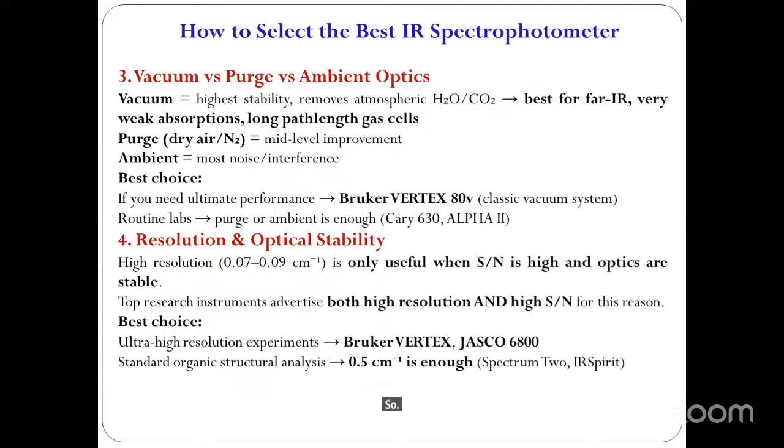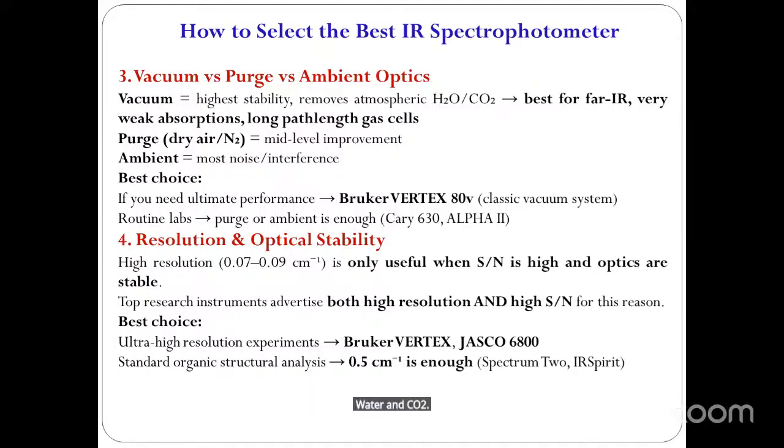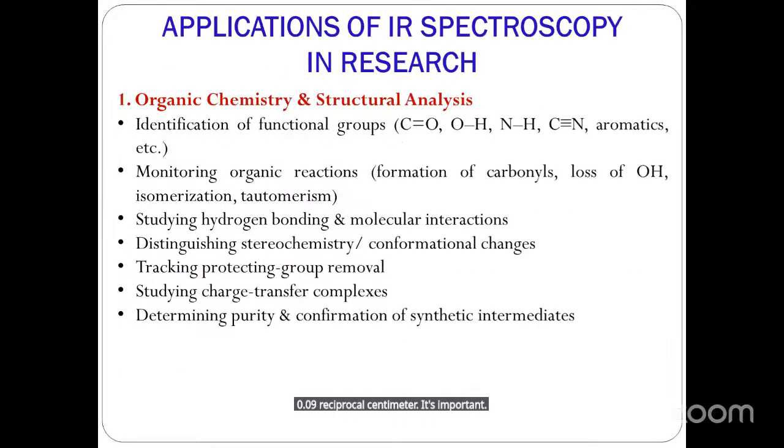Vacuum, as it has high stability, removes the background interference of water and CO2. And as far as resolution is concerned, the resolution should be very high, and it is directly related to signal to noise ratio. A high resolution between 0.07 to 0.09 reciprocal centimeter is important.